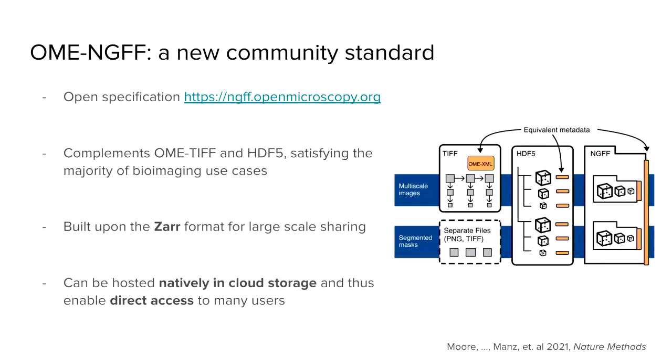So an important part of the picture painted by the OME community about these different formats is that really they're complementary. So OME-TIFF, HDF5, and Zarr NGFF share equivalent metadata. However, the binary representation might be different. And so for those reasons, these formats might be able to suit very different needs in the bioimaging community combined. And in particular, today I'm going to be talking about the advantages of using this new NGFF format.